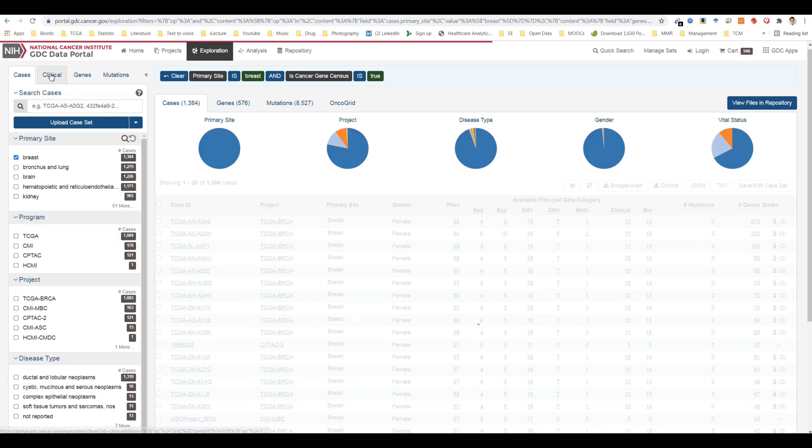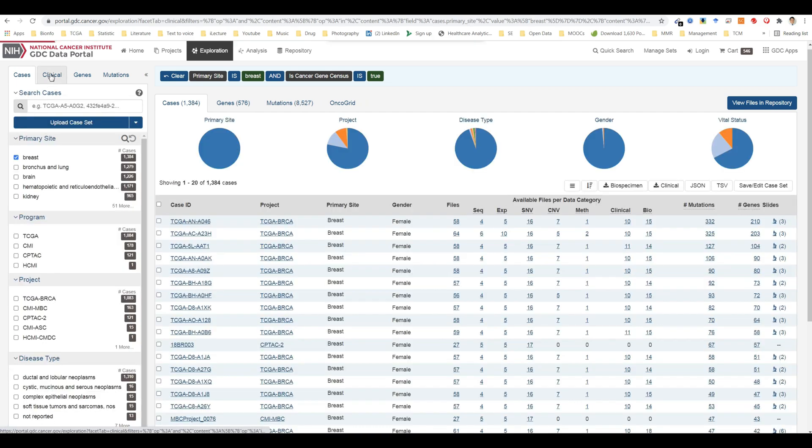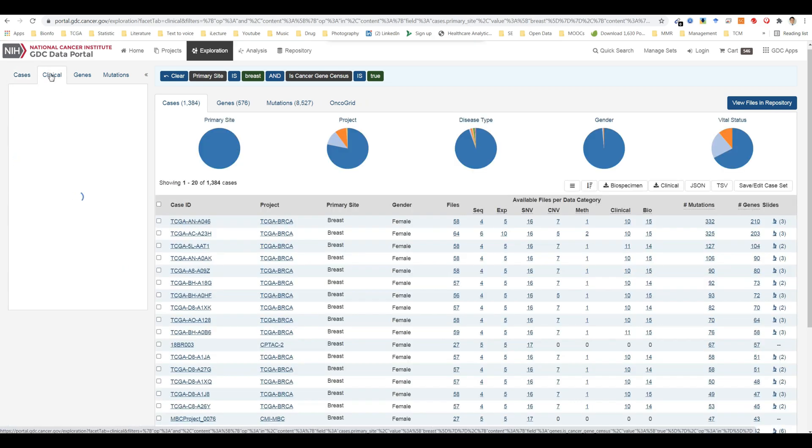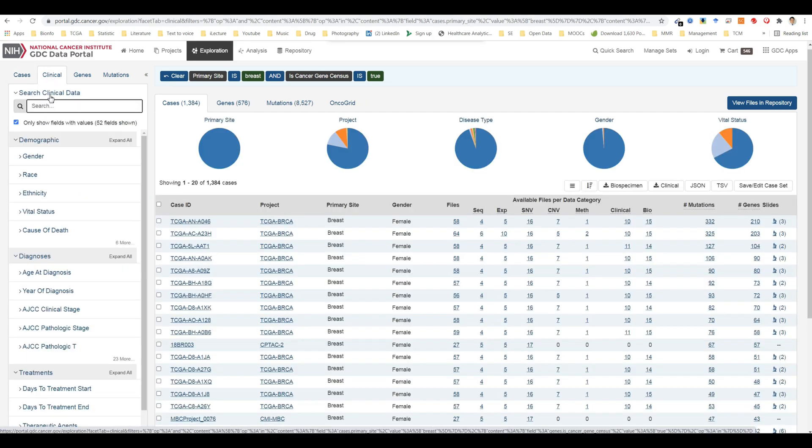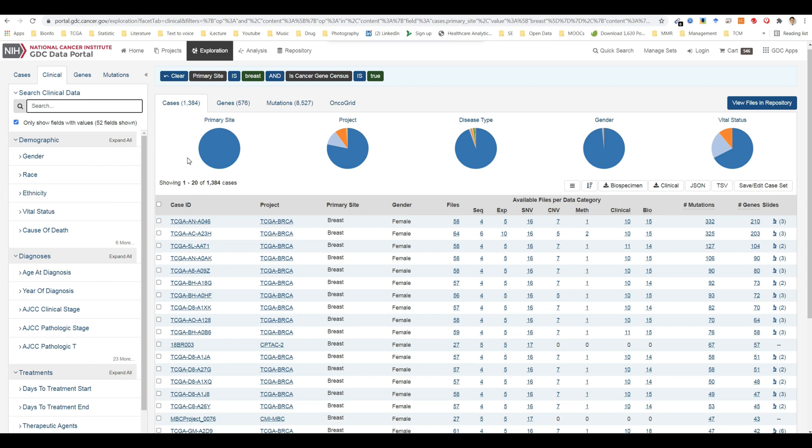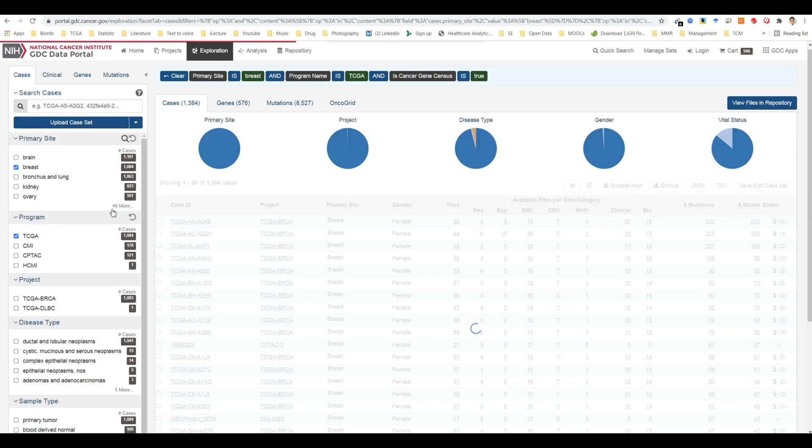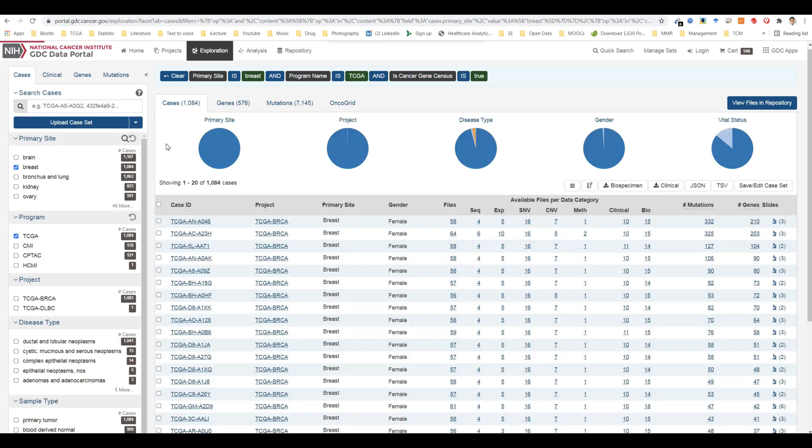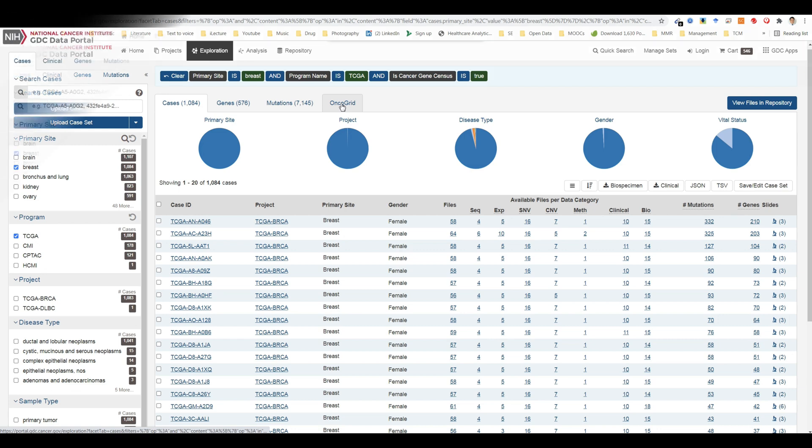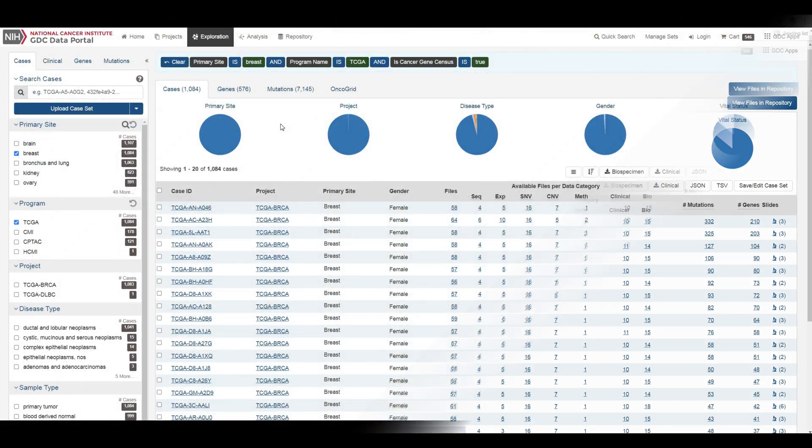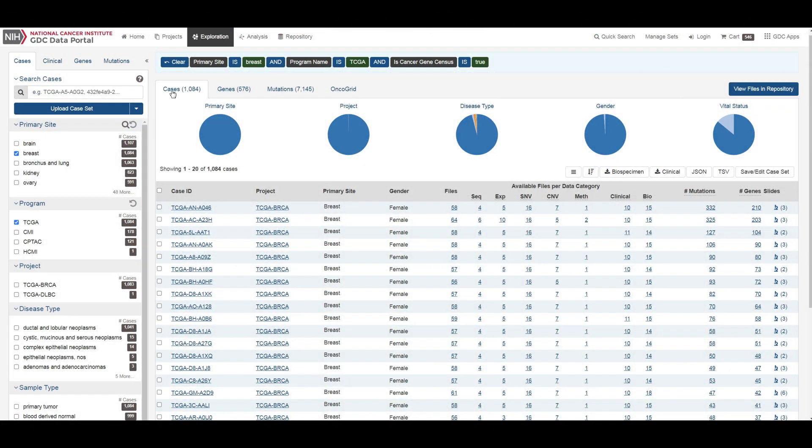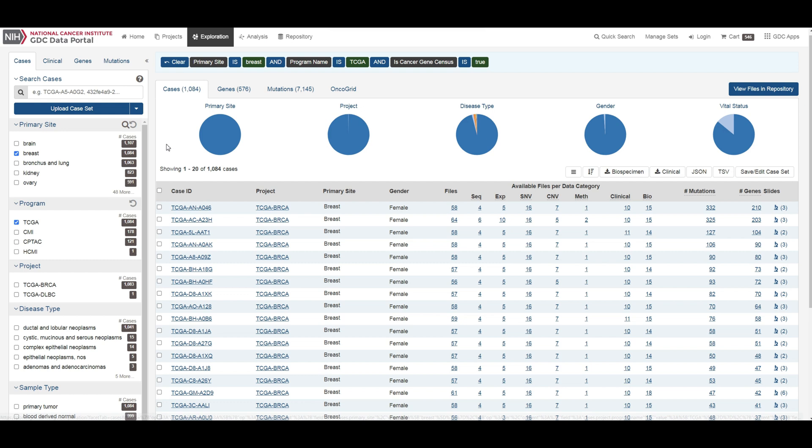There is also a clinical tab with filters that apply specifically to clinical data. As users add filters to the data on the exploration page, the results section will automatically be updated. Results are divided into different tabs: cases, genes, mutations, and oncogrid. The cases tab gives an overview of all the cases who correspond to the filters chosen.